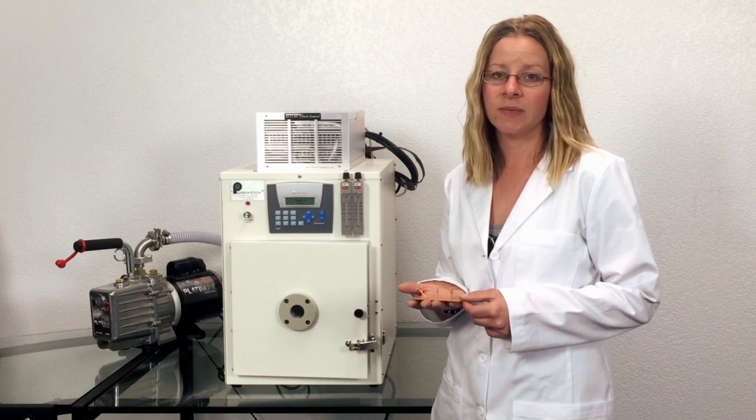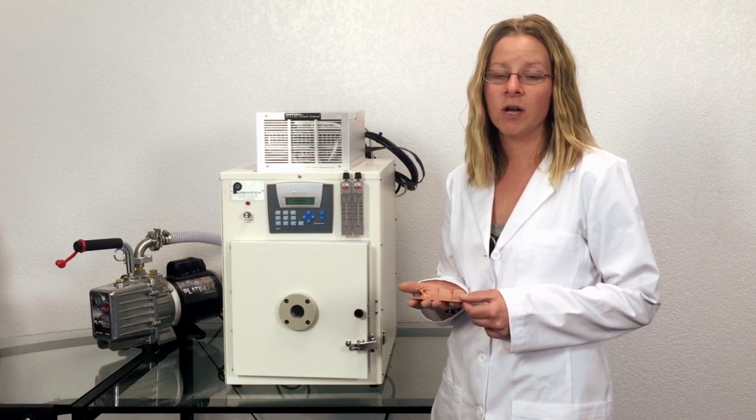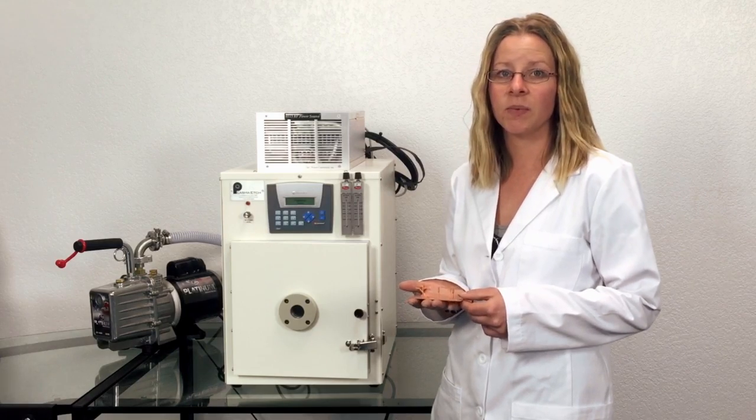Operation of our plasma systems is very simple. First, load the chamber with the sample you are etching.